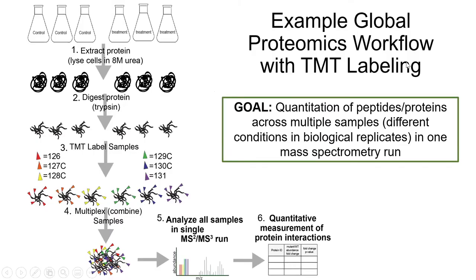Here, I just have a semi-generic proteomics workflow that includes TMT labeling, with a goal of quantitating peptides and proteins across multiple samples, that would be different conditions and different biological replicates, in one mass spectrometry run. And so throughout the lecture, I'll hone in on some more details of some of the specific steps I've labeled in the workflow.